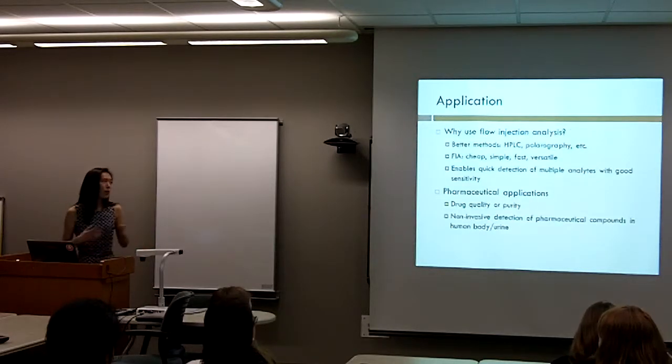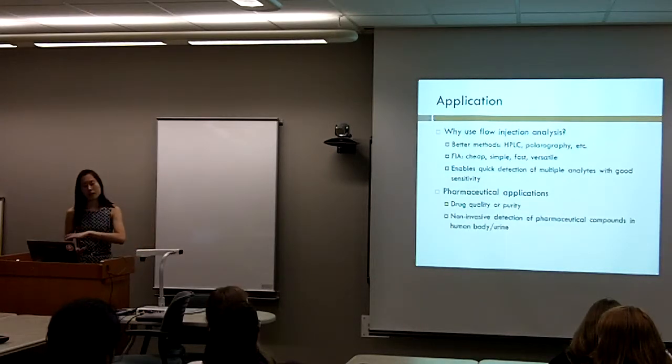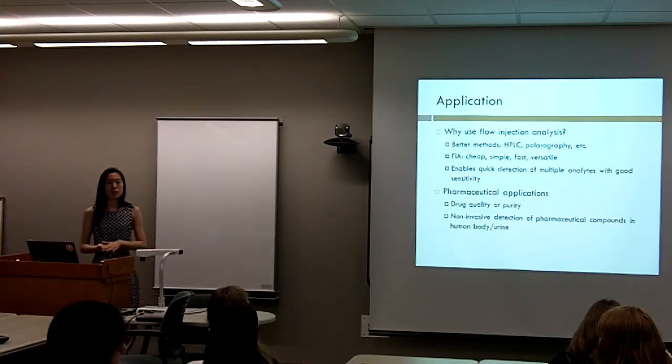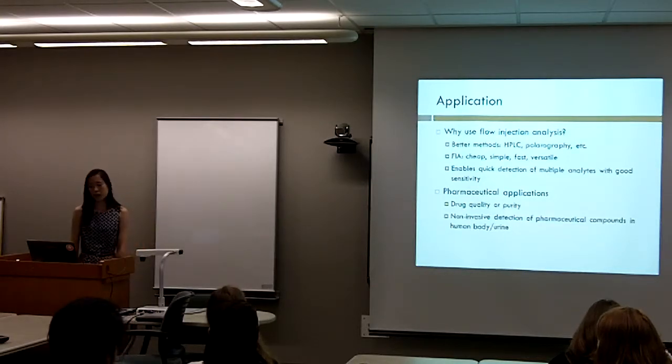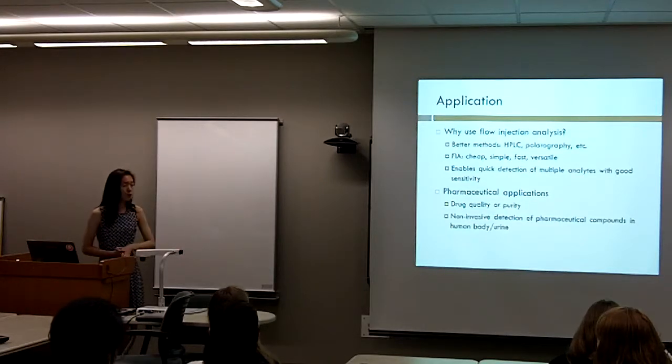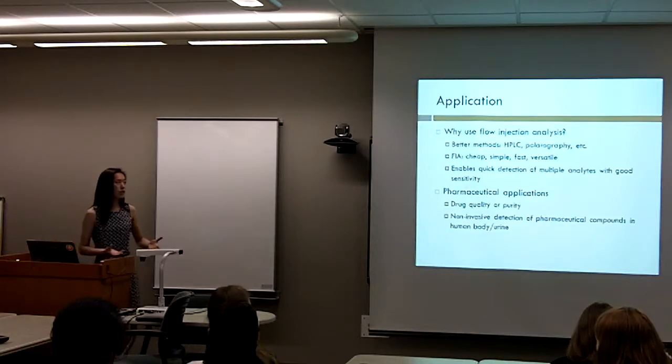So some of you might ask, why should we bother studying flow injection analysis? If you know any other methods for the separation or detection of molecules, you might know HPLC, high performance liquid chromatography, is much more efficient, it's much more accurate. You have differential pulse polarography or a bunch of other methods. So why would we bother using flow injection if you have things that are so much more accurate?